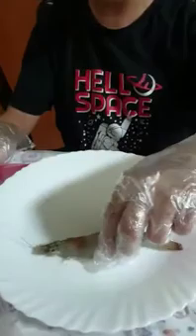Shrimps are arthropods, and arthropods have jointed legs and segments. They have segments, as we can count: 1, 2, 3, 4, 5, 6. There are 6 segments and many legs.